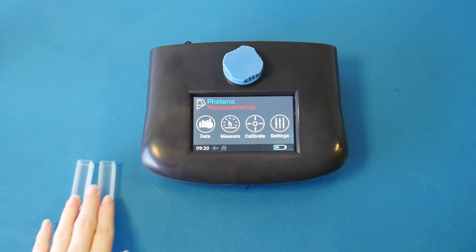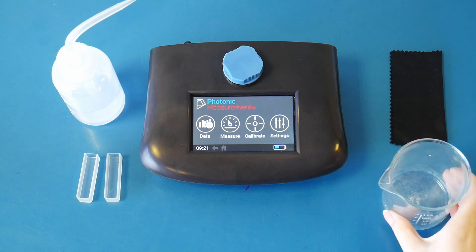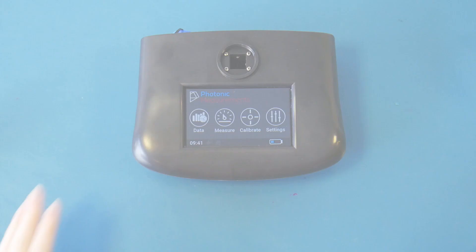To get started with the GO you will need two quartz cuvettes, a sample dispenser, a cloth to clean any residue off the cuvettes, and an empty container.